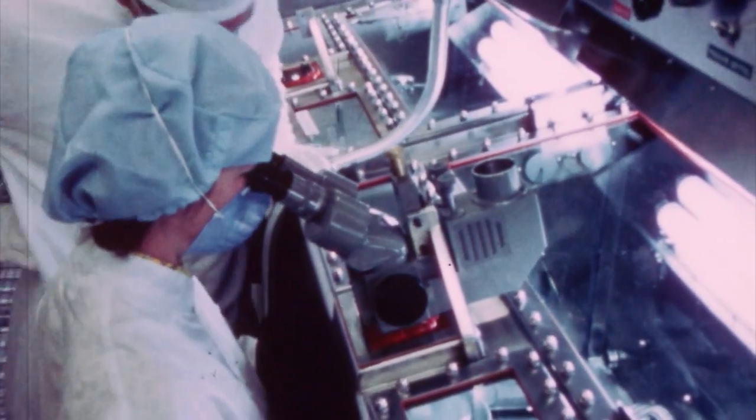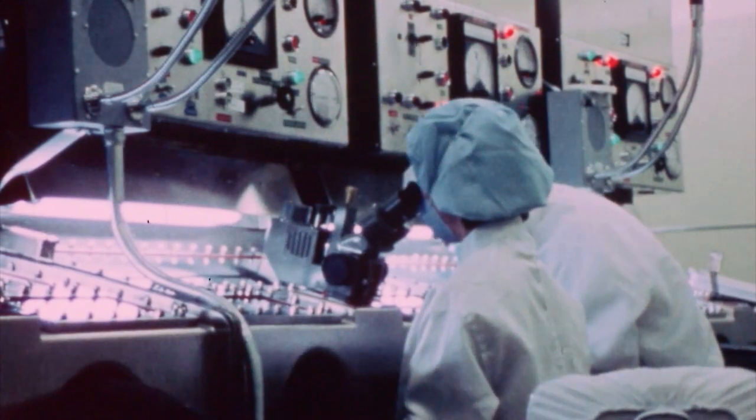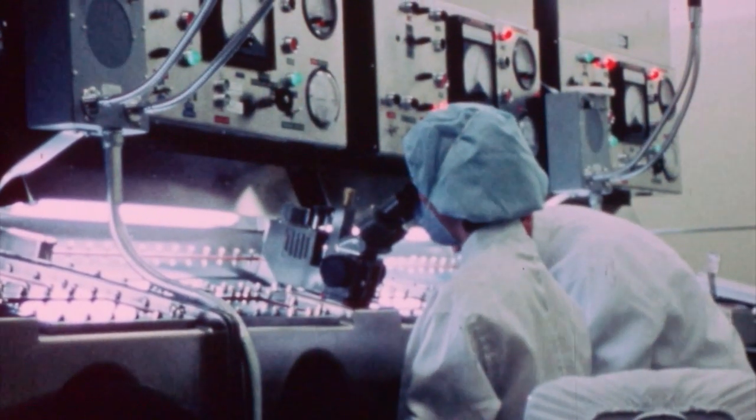And then you would take the Petri dish and put it underneath the microscope. We only looked at the Petri dishes twice a week. Sometimes it would be me, sometimes it would be some of the other women. And that's how we examined the Petri dishes to see if there was anything growing on them.